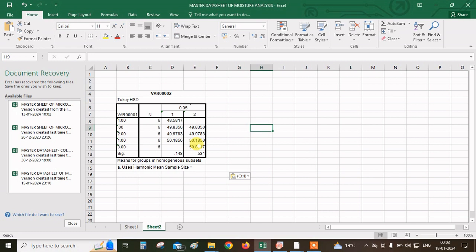So in order to understand the groups of the data that are having the significant differences in the statistical interpretation, we always use a post hoc Tukey test, which means after we have done the one-way ANOVA, which means one-way analysis of variances, where we basically compare the means of the sample populations and try to find out whether these means have a significant difference or not.